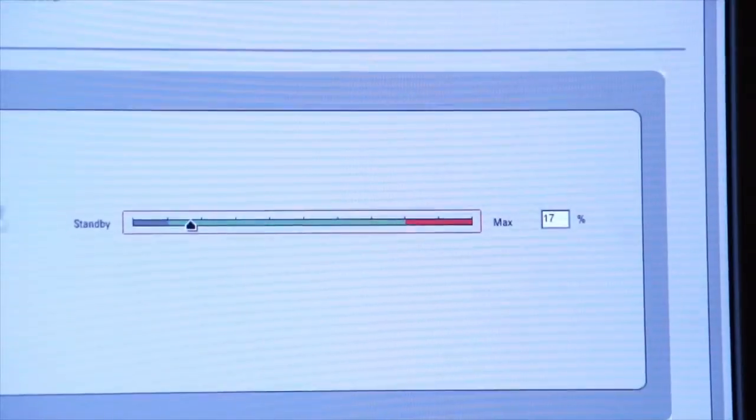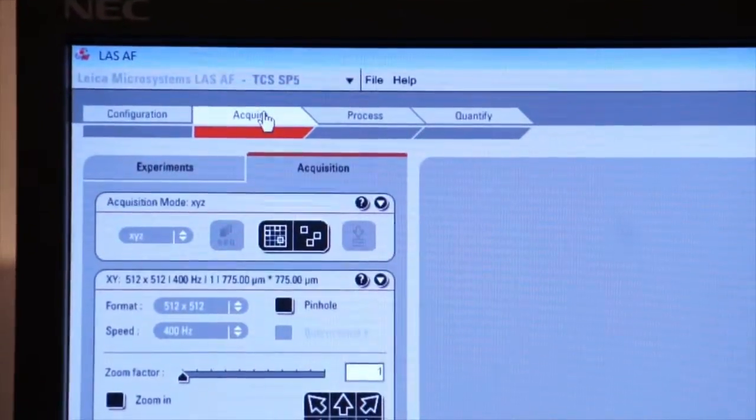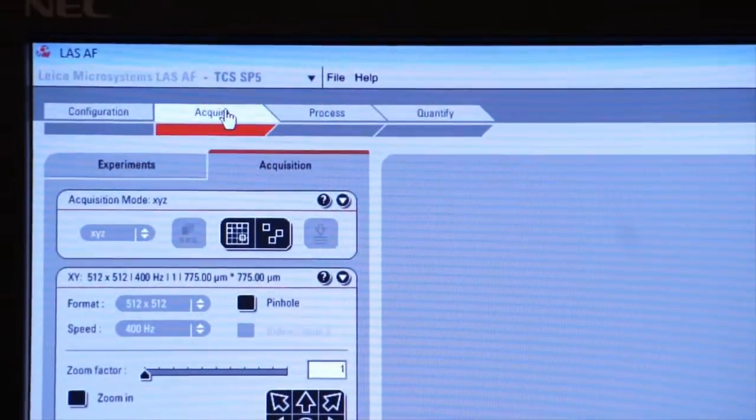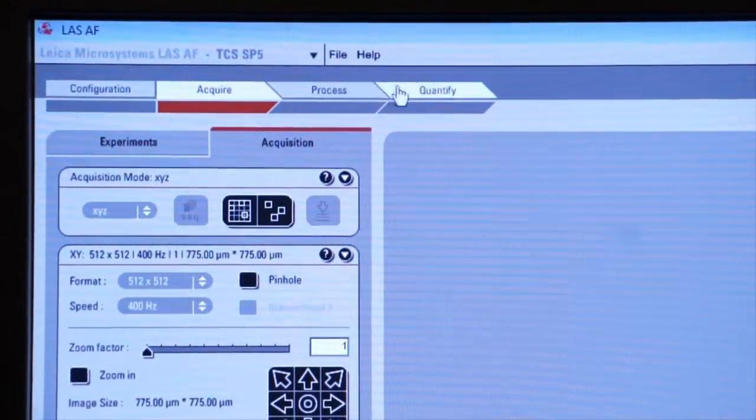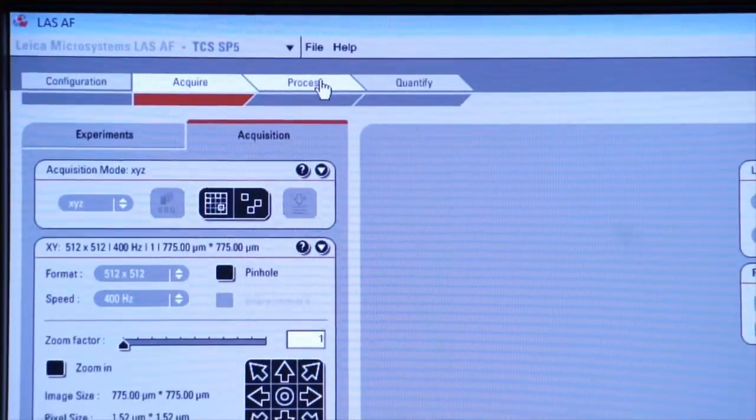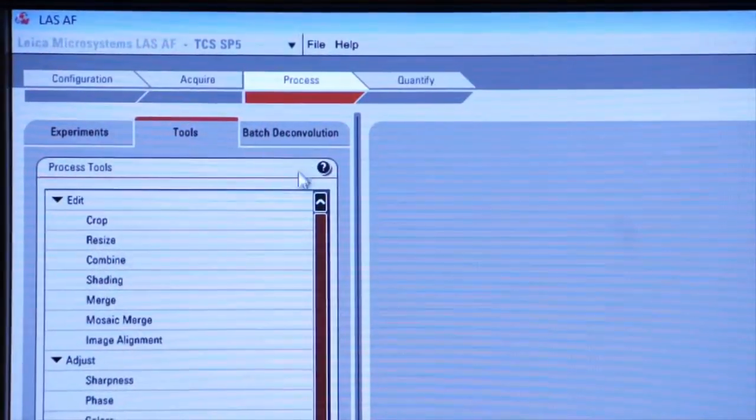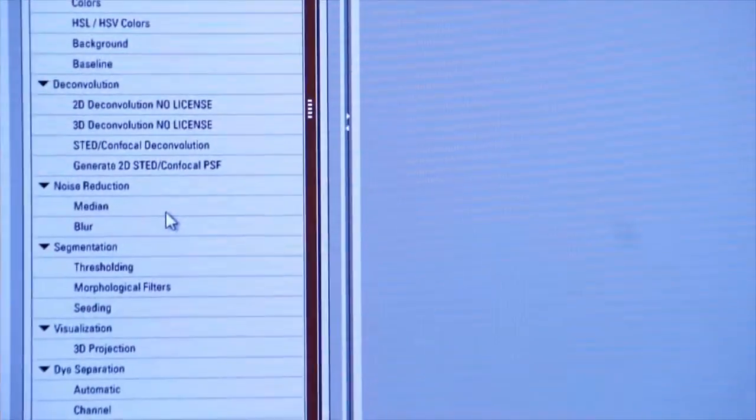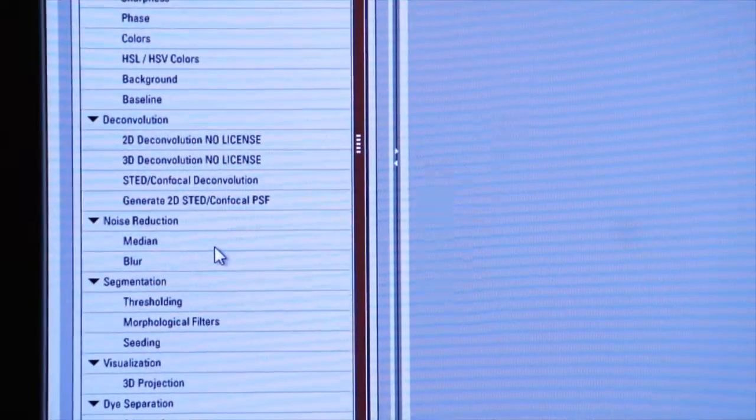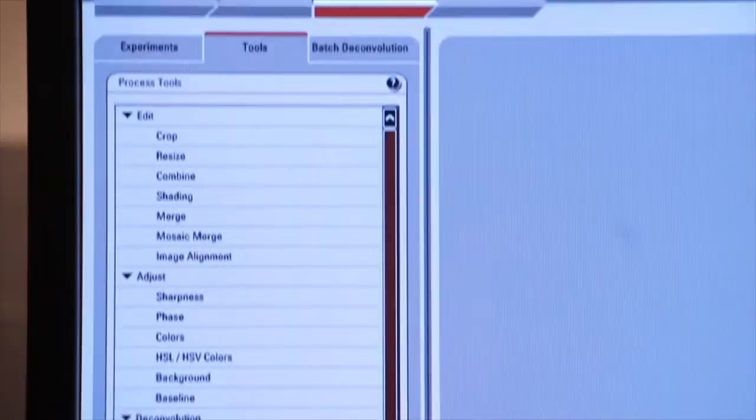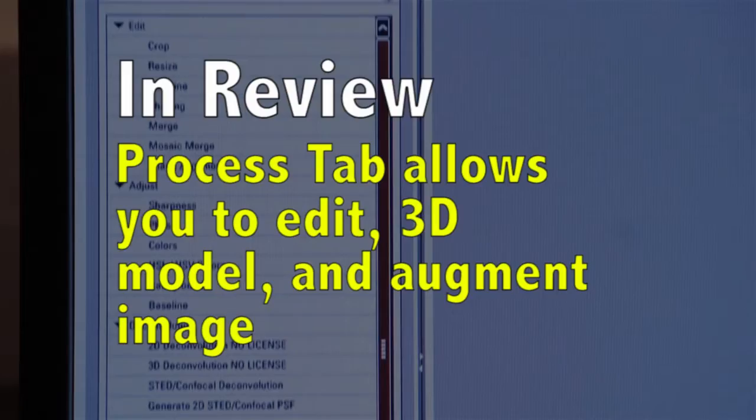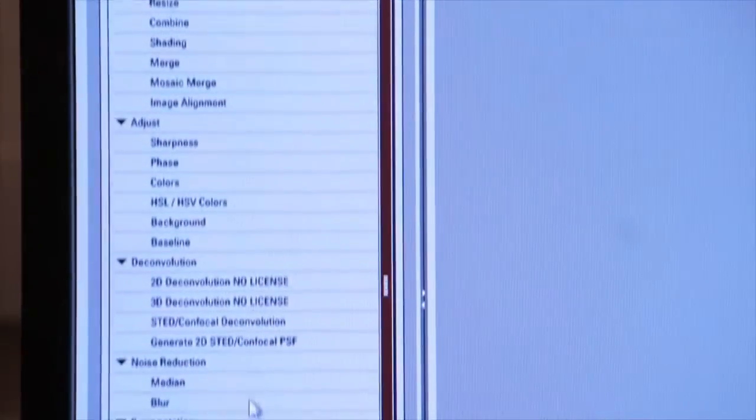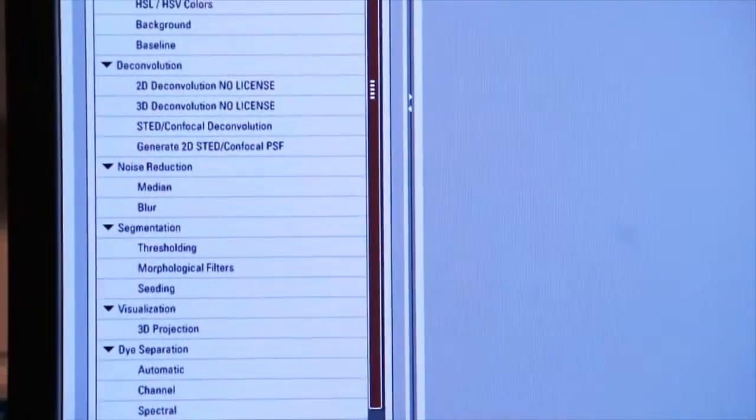Once the lasers are turned on, we can go to our Acquire tab and begin our experiment. But again, by way of review, I want to point out the other two tabs that are up here. The Process tab is an important tab with many functions underneath it which will allow you to do things like your 3D imaging, your maximum projection, your deconvolution, things of that nature. We'll cover these in future sessions.